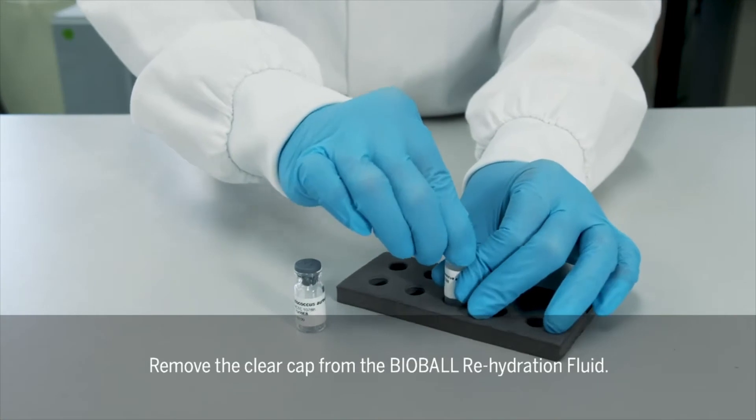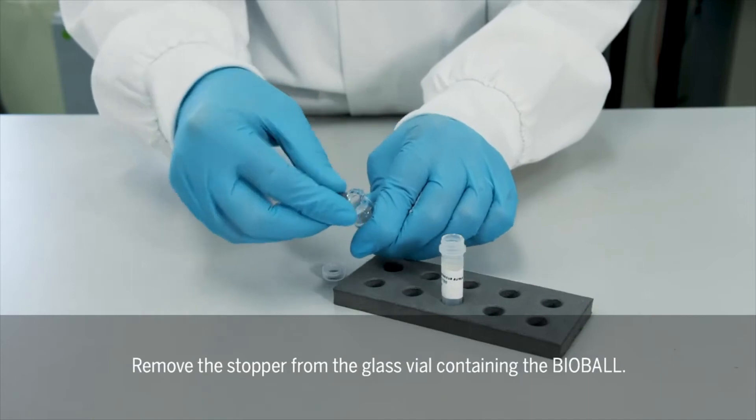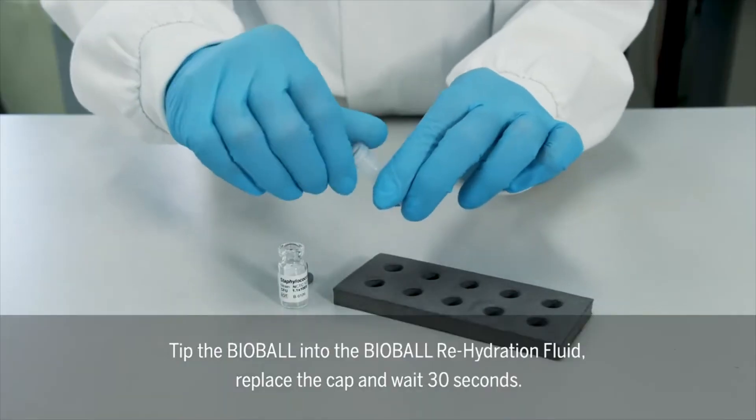Remove the clear cap from the Bioball Rehydration Fluid. Remove the stopper from the glass vial containing the Bioball. Tip the Bioball into the Bioball Rehydration Fluid, replace the cap, and wait 30 seconds.